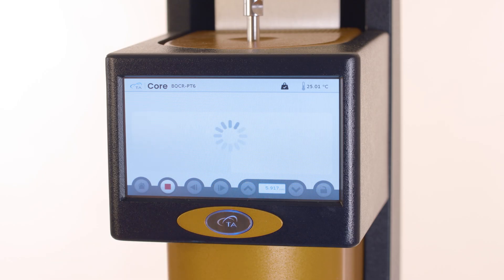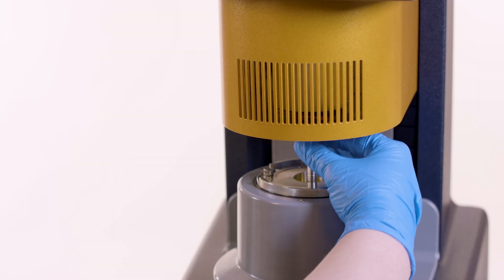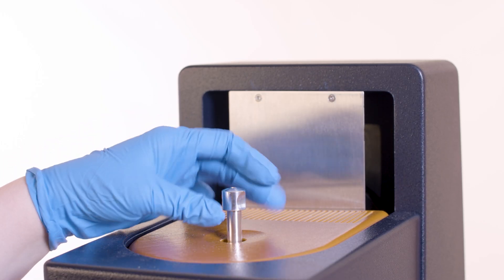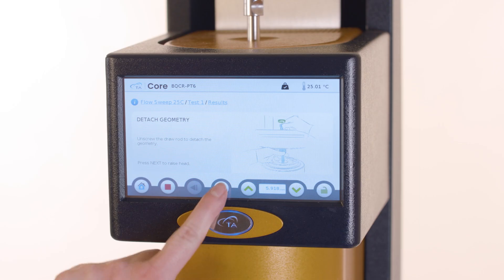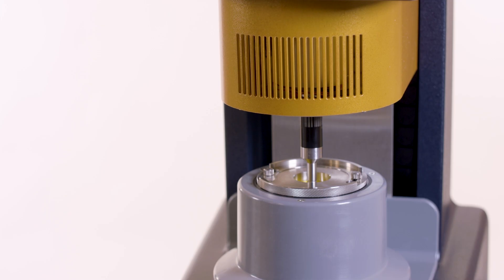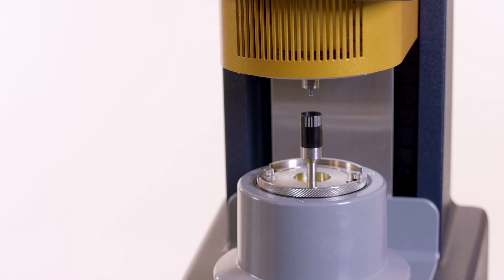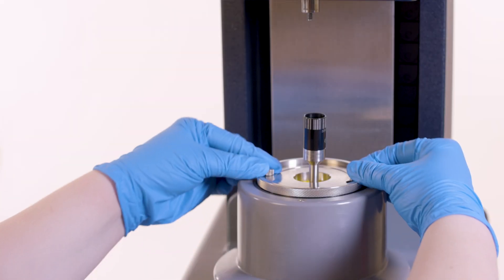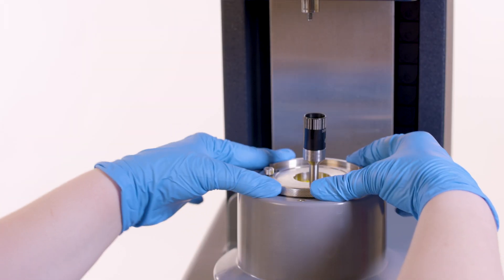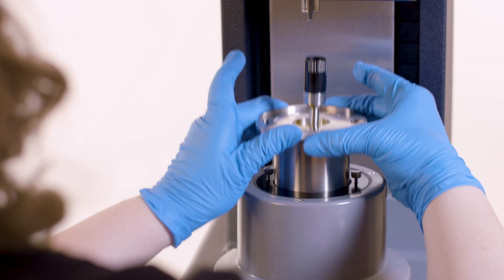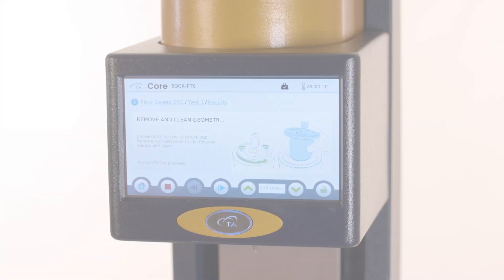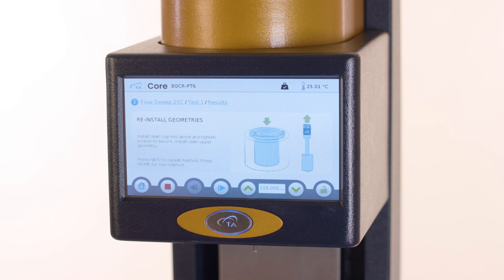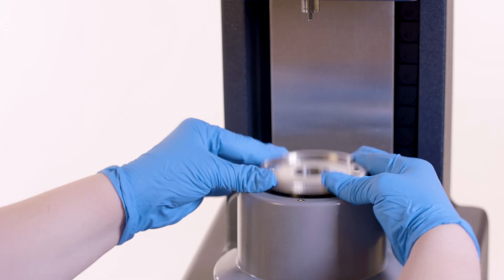Press next to clean the sample. First, detach the geometry by unscrewing the draw rod. Press next to raise the head. Loosen the thumb screws and remove the cup and geometry. After disposing of the sample and cleaning the cup and geometry, press next. RayoGuide now instructs the user to reinstall the cup and geometry.